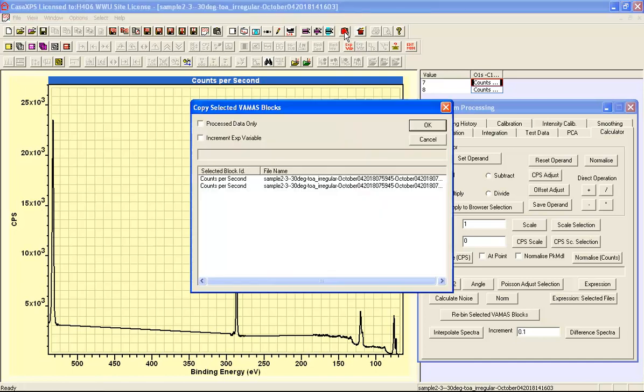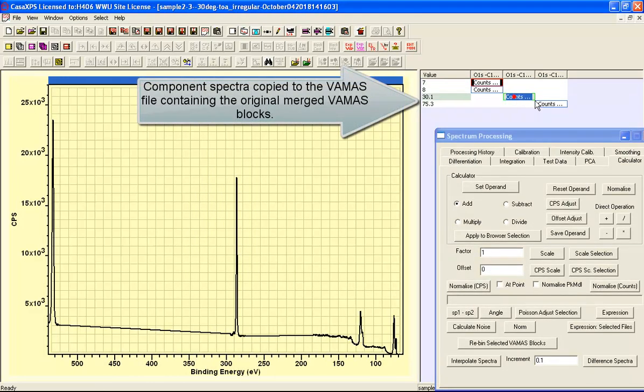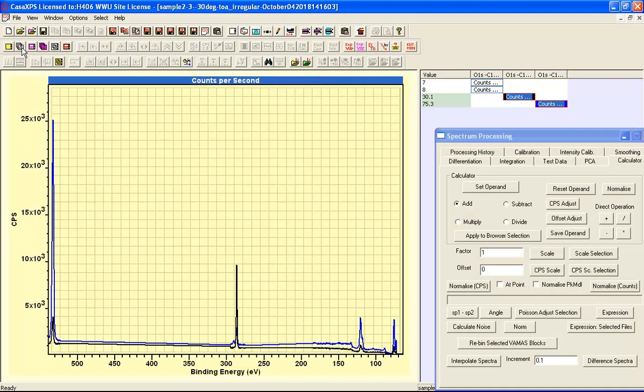Copy button. These two VAMAS blocks represent the component data that have been calculated using the difference method. So I overlay these in the active tile and then I select the two VAMAS blocks that contain the original data.